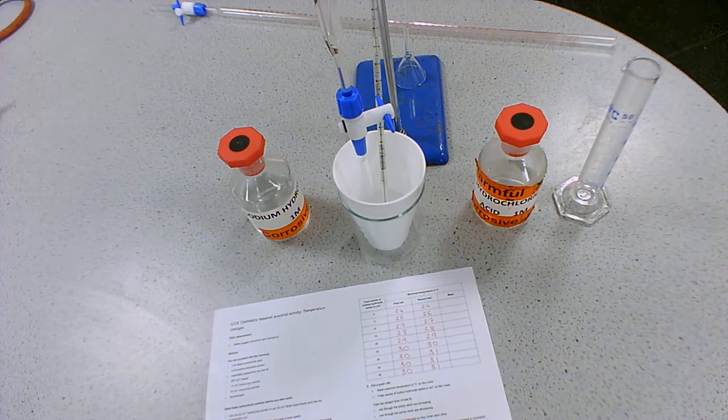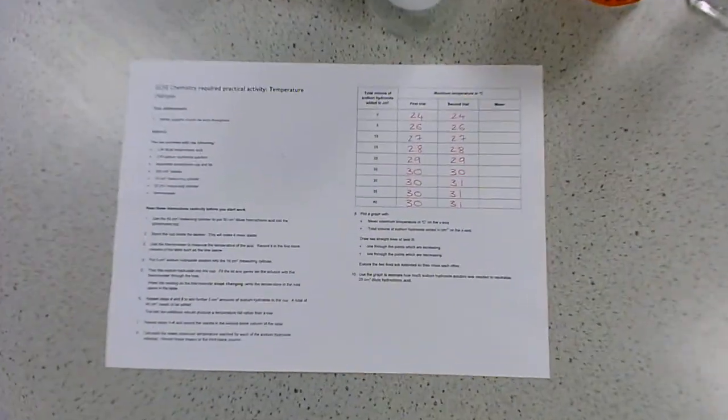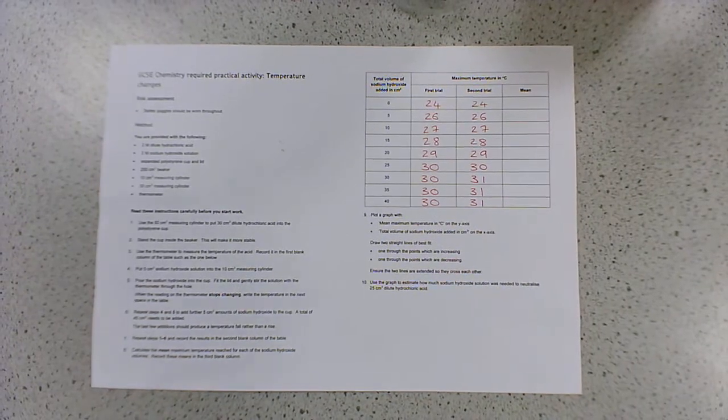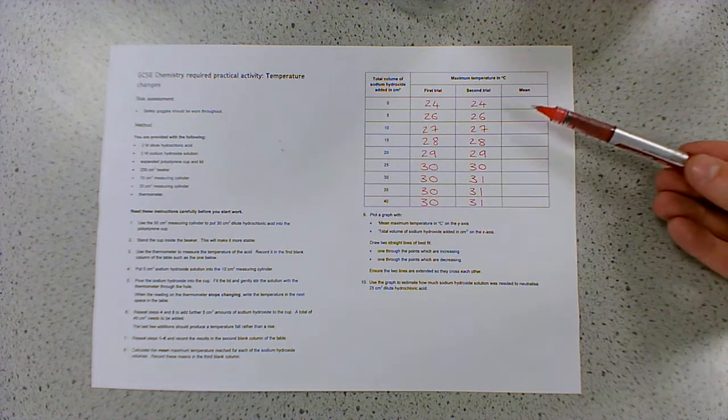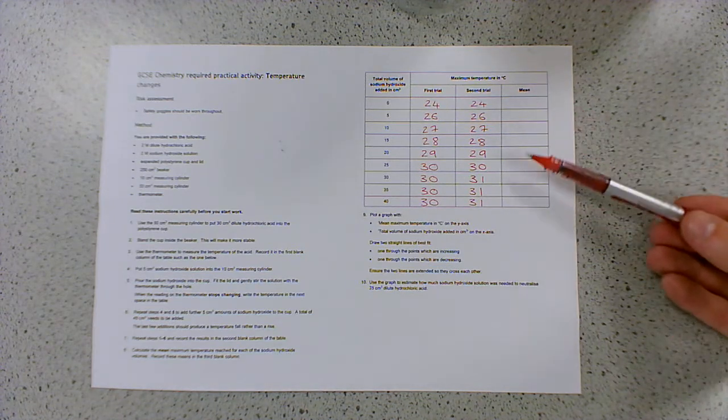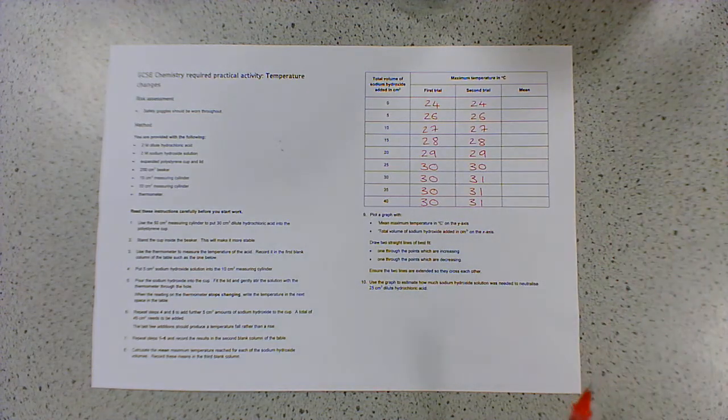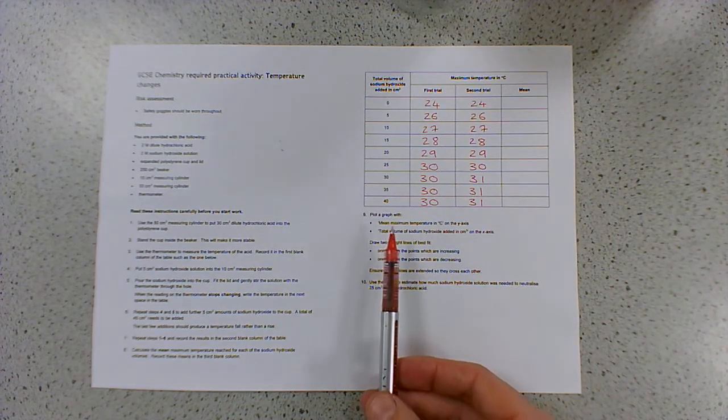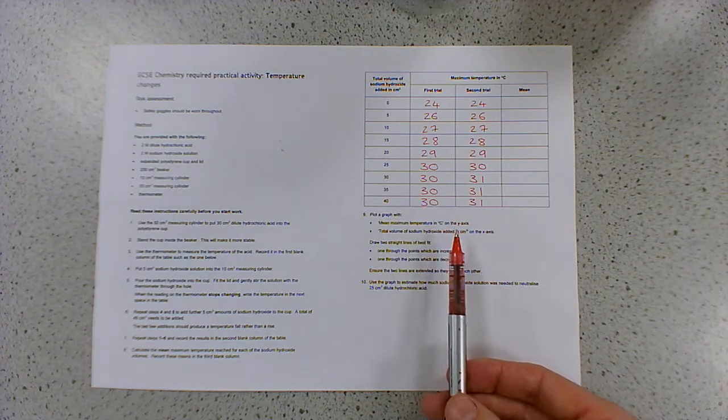So we've now got our results, and if I zoom in on those, OK, so what you're going to have to do is calculate the mean of those values, it's not going to be very difficult, certainly not for the first few, calculate the mean, and then plot a graph showing the mean temperature on the y-axis and the total volume of sodium hydroxide on the x-axis.